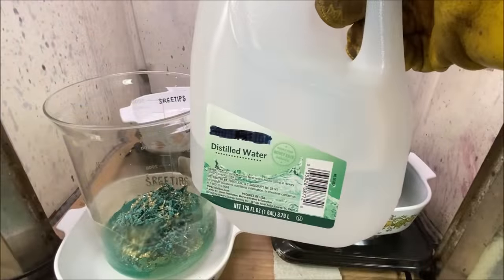But my experience with this stuff is that it looks like there's a ton when it's in the beaker. And then when we get it out to dissolve it and get it precipitated, it's going to be a totally different story.